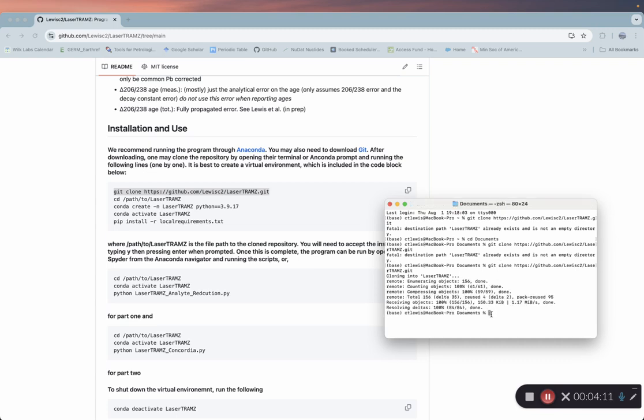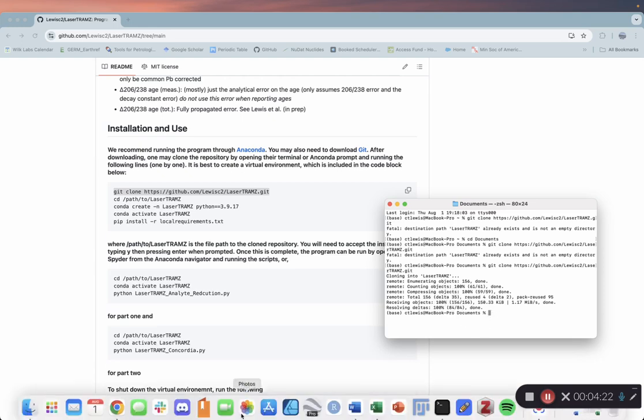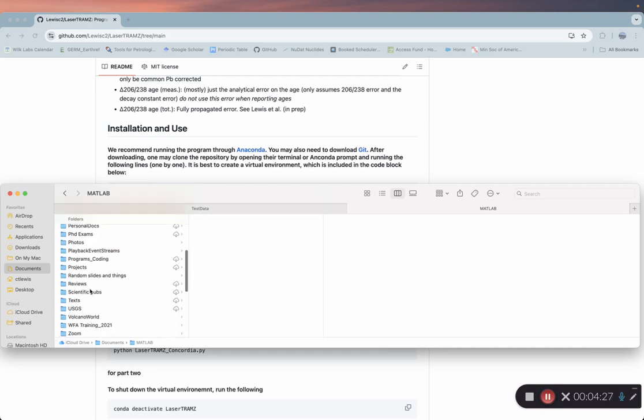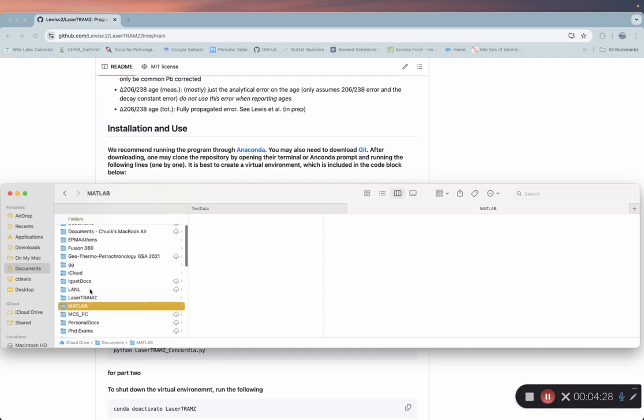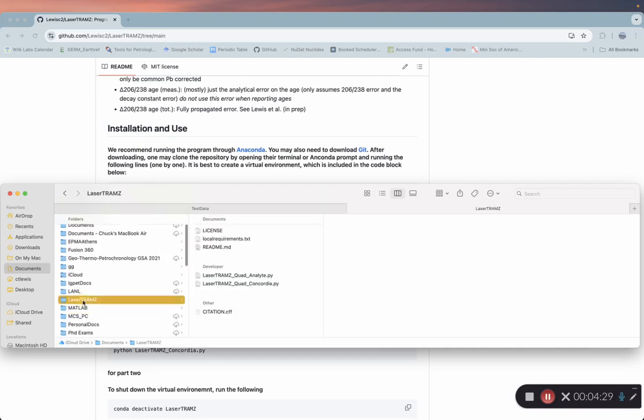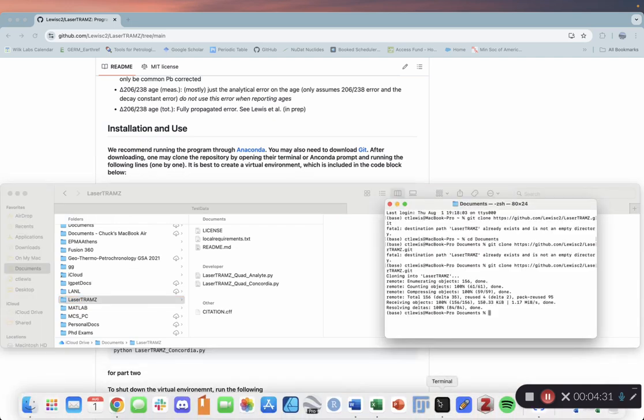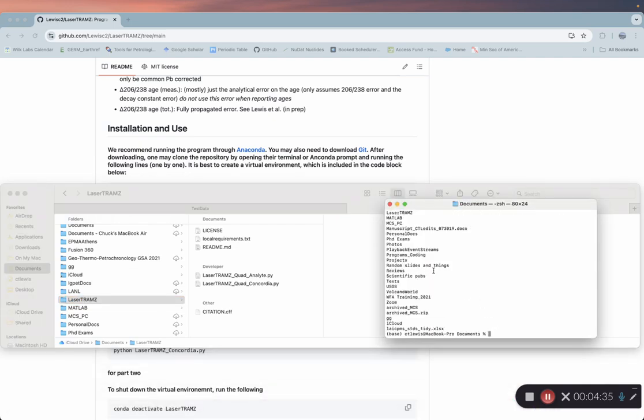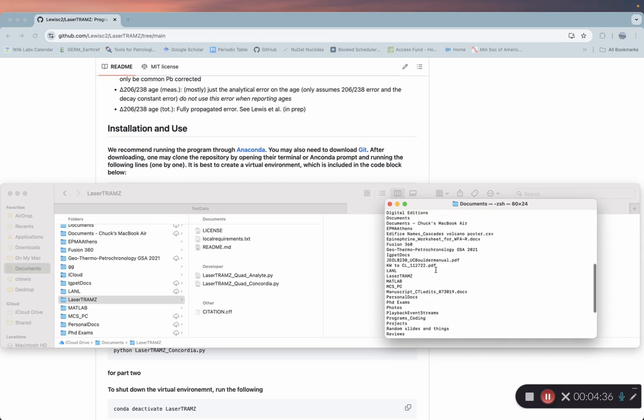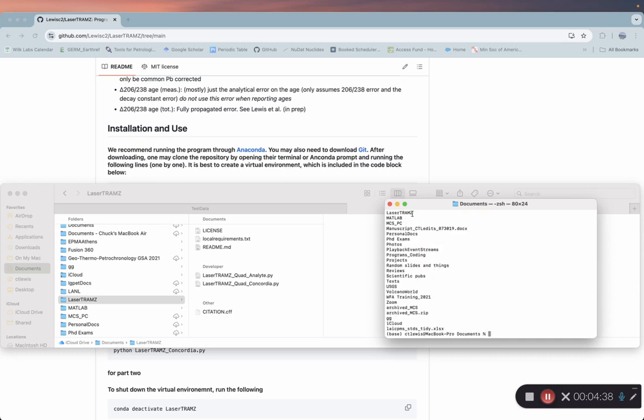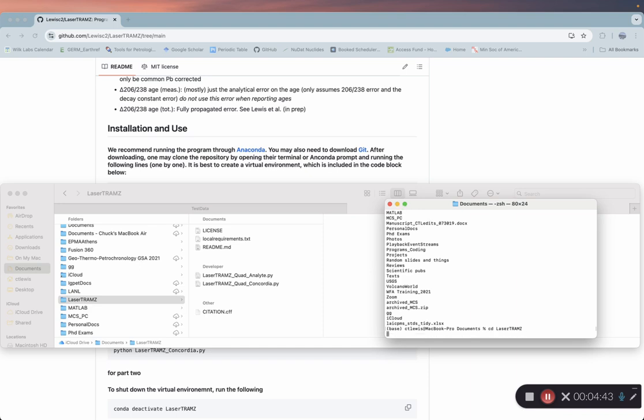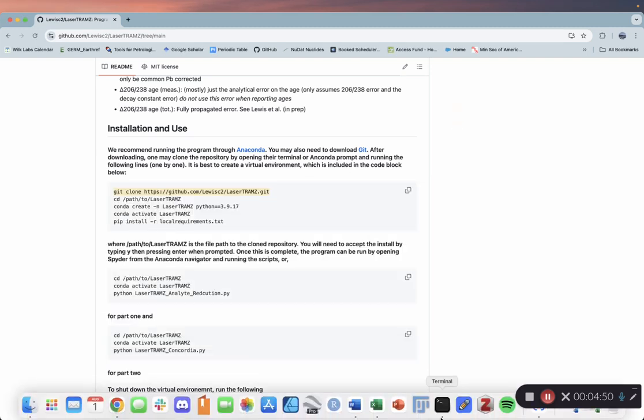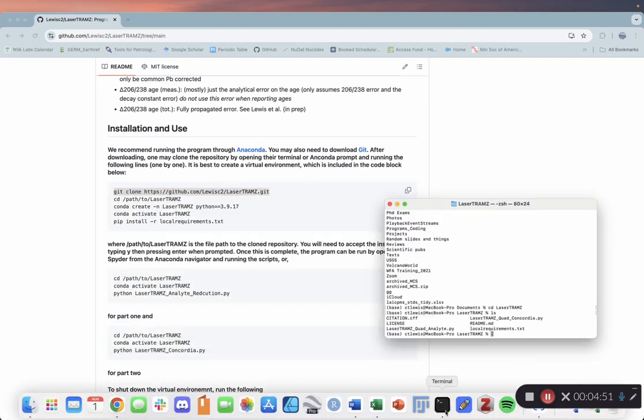Now we need to go into that folder. For those of you that don't know, we're just navigating the directory right now. We're in documents, and we're going to change our directory to LaserTramZ. If you want to see all of your files, just type ls, and that'll give you a list. There it is, LaserTramZ. So we're going to change directory to LaserTramZ. And there's the files that are on the GitHub page.